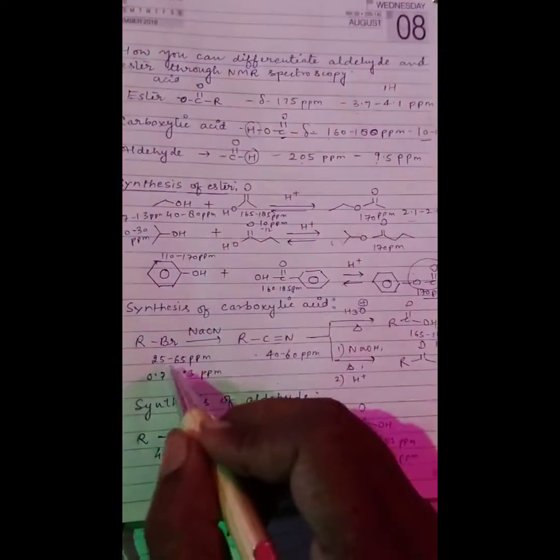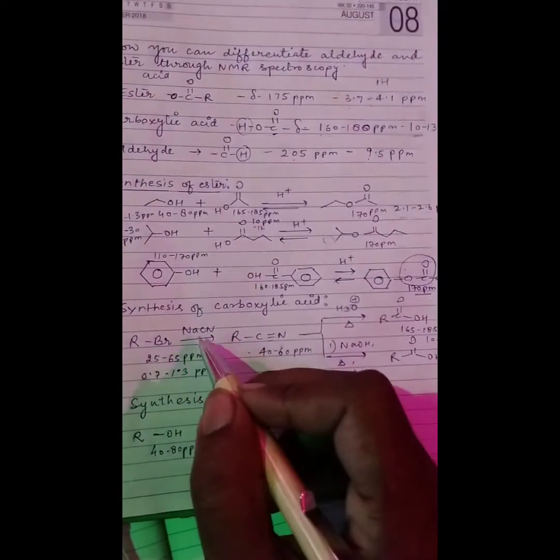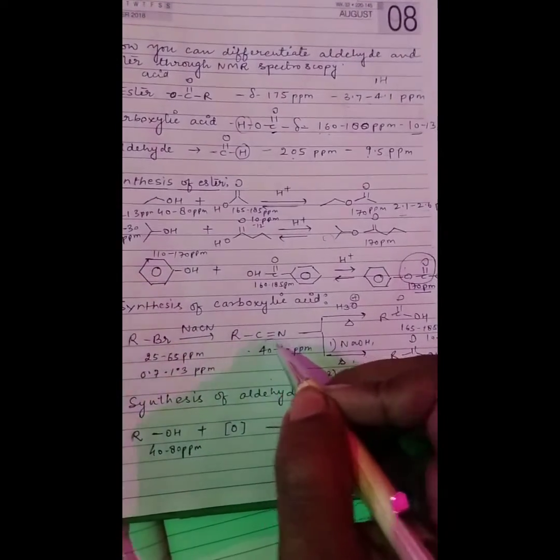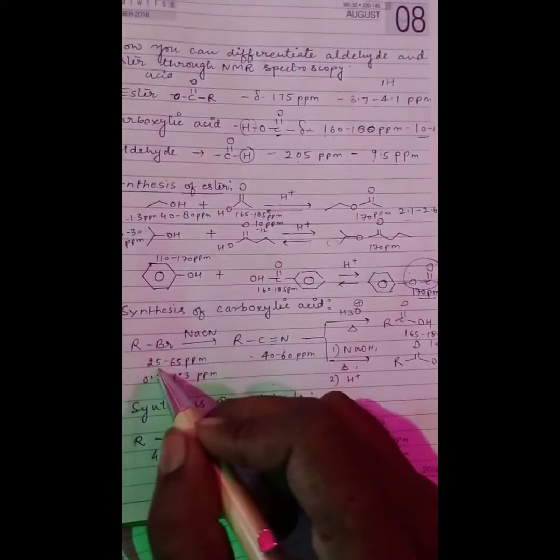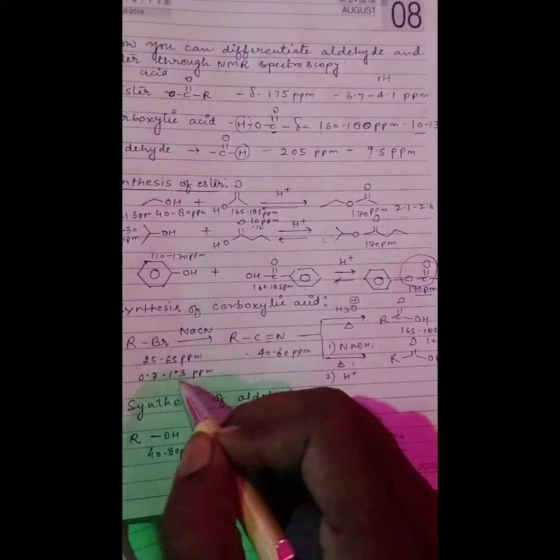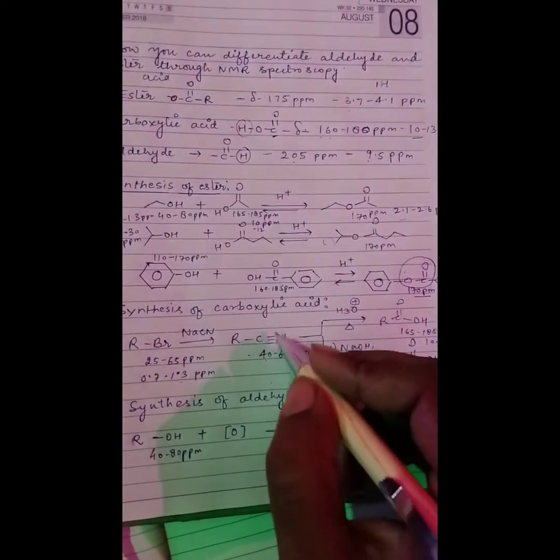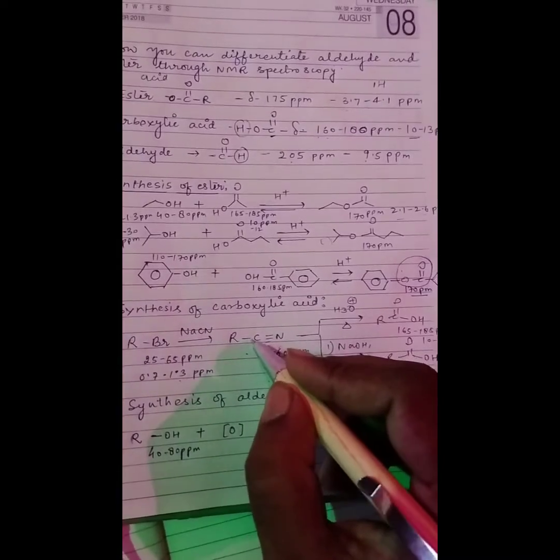Similarly, carboxylic acid can be synthesized from organic halides in the presence of NaCN. You can prepare the RCN. The R-Br peaks appear at 25 to 65 ppm, and in proton NMR 0.7 to 1.3 ppm appears, while 40 to 60 ppm appears for the CN, meaning in the C13 spectrum.